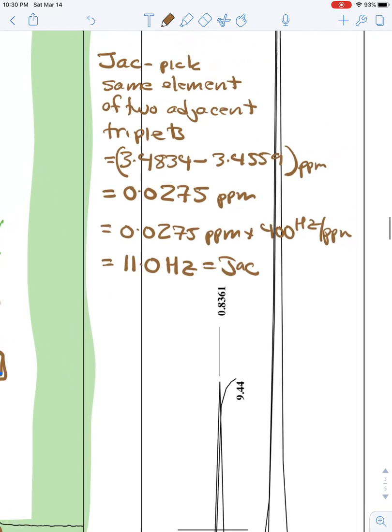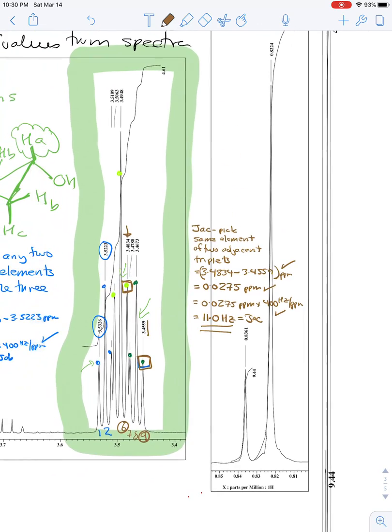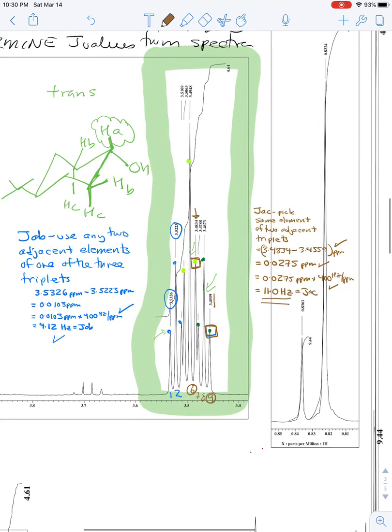And so we're going to subtract those two values, just as we did before, get the difference between them in parts per million, multiply that by 400 hertz, and that gives us a value of 11 hertz for JAC. And again, that's what we expect. And notice again, it's significantly larger than the coupling constant value for JAB.